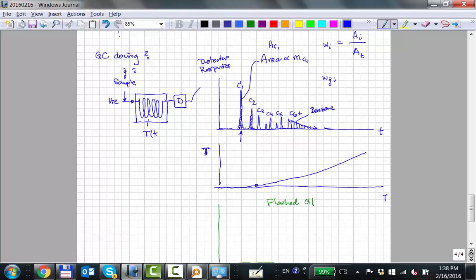I don't know. They zap it with electricity. I don't know what it is. It's some detection of anything but helium. And for this pressure, the response will get to 0? Because if there's nothing there, the response will go to 0 because nothing else is coming out except helium. So it's detecting a response to hydrocarbons.